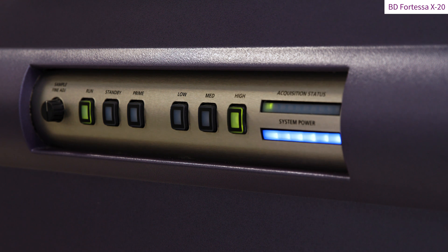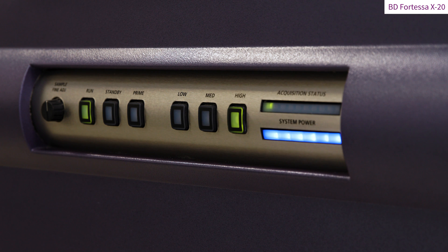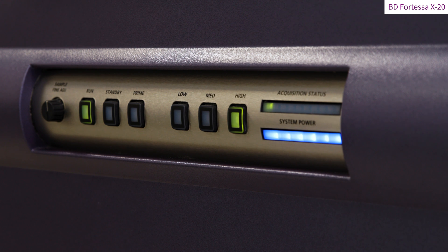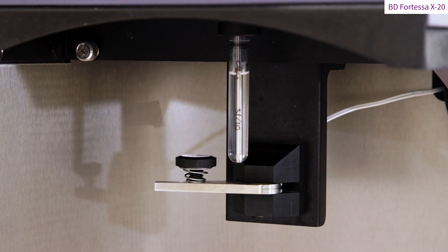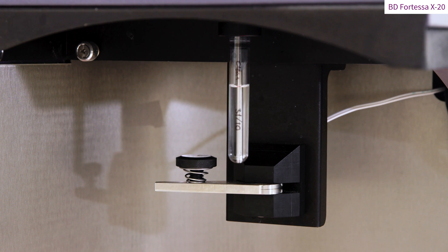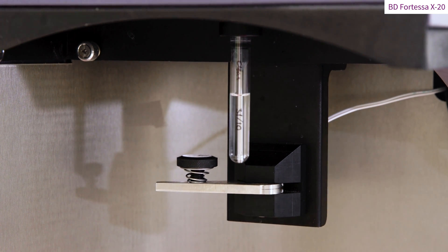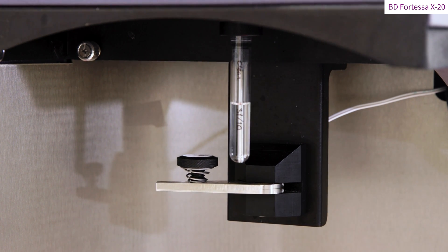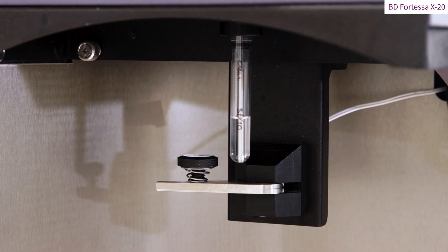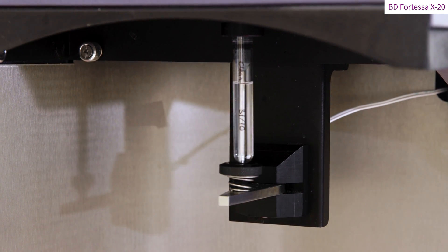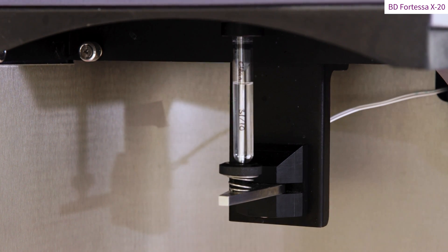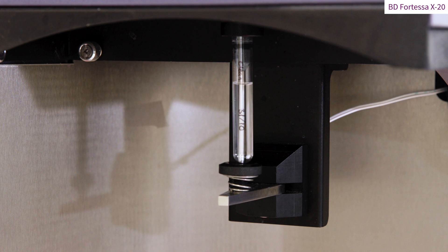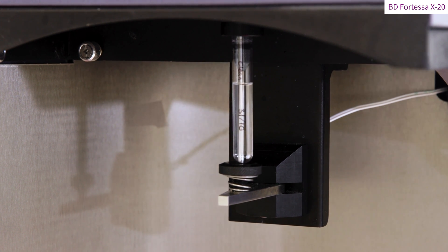Using the Instrument Fluidic Control Panel, press Run and set the flow rate to High. Install a tube containing 3 mils of BD FACSClean on the sample port and ensure the tube support arm is left to the side. Let the instrument aspirate the solution for one minute. Move the tube support arm under the tube and allow the instrument to aspirate the solution for five minutes.